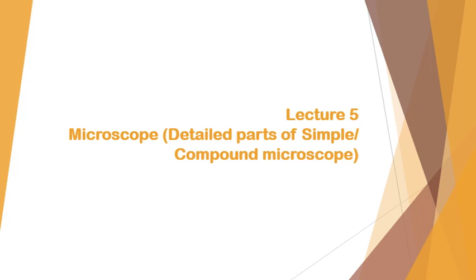So for this purpose, we should emphasize the usage of the microscope, and being a science student, one should know the usage of the microscope and its fundamental or major parts. So in this lecture we reveal different parts of the microscope.